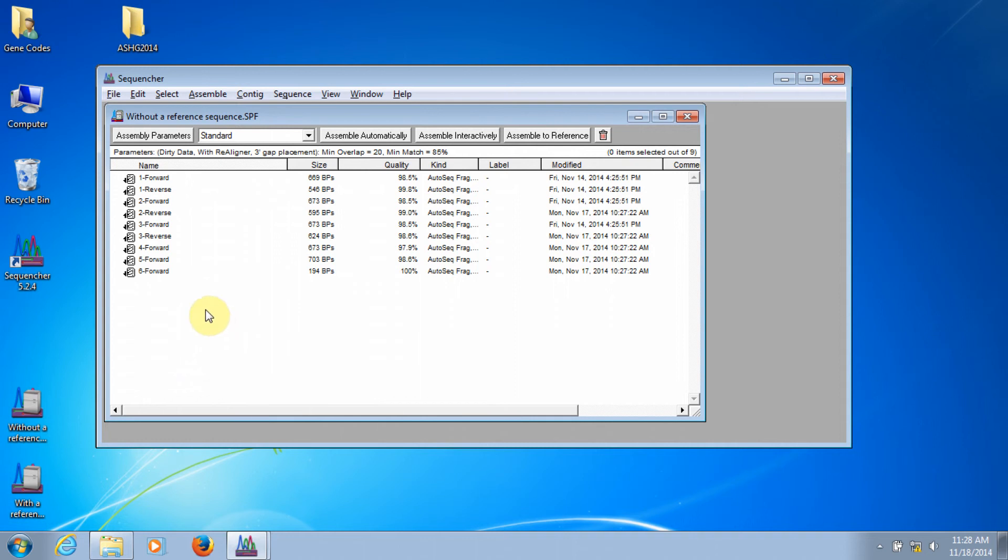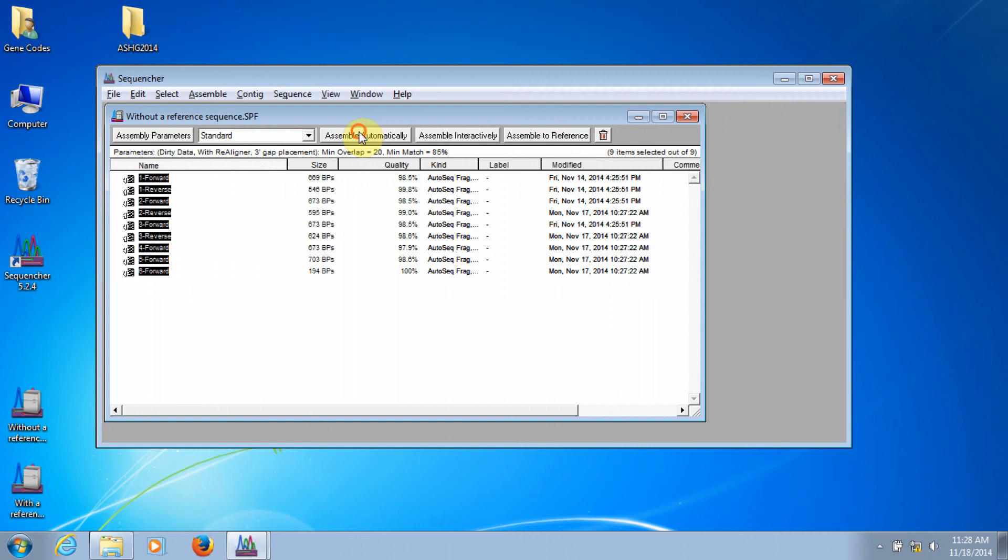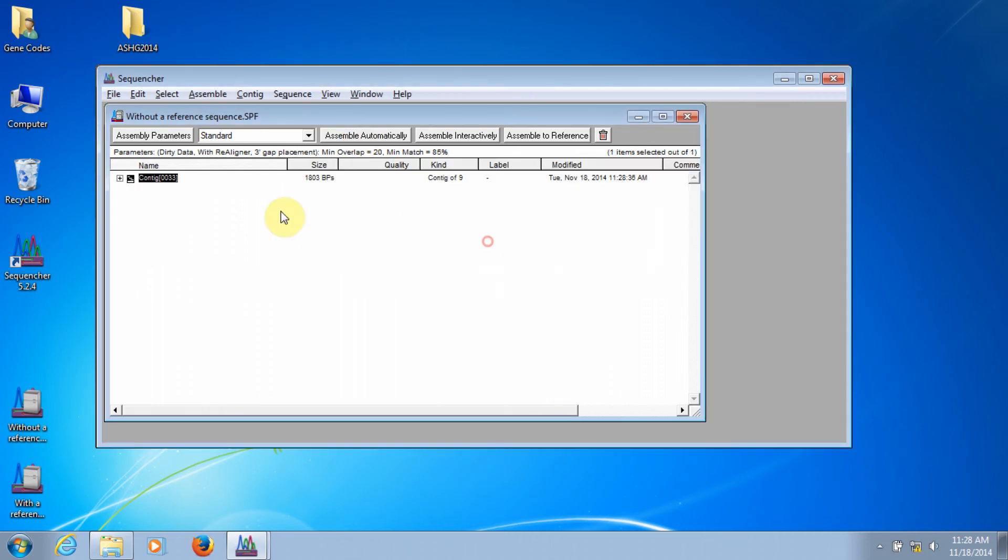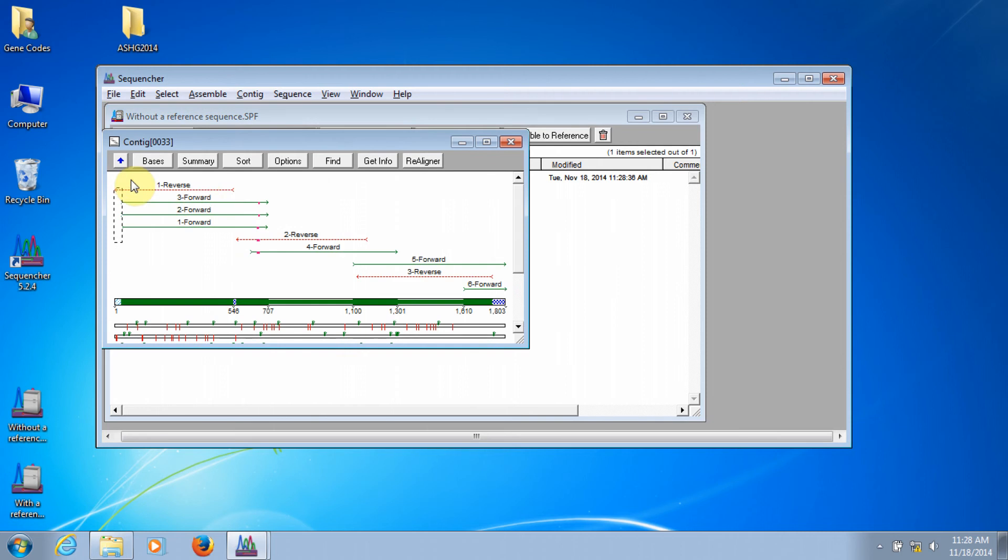To assemble, I highlight the sequences and select Assemble Automatically. Now, you can see instead of all of those sequences in the project window, we just see this single contig. If I double-click on the icon, it brings up the overview view of the contig.